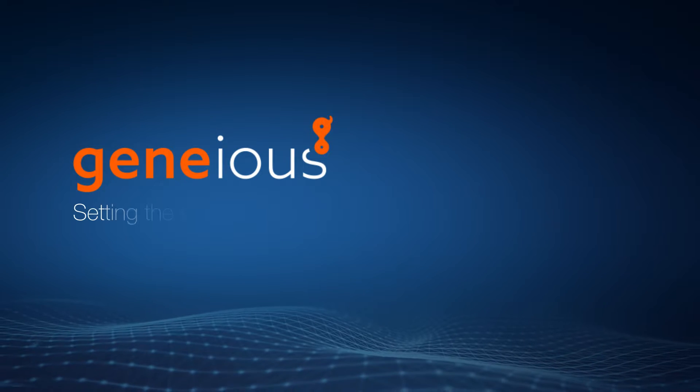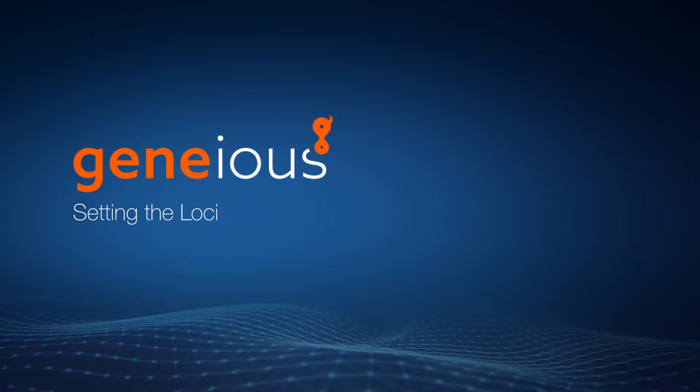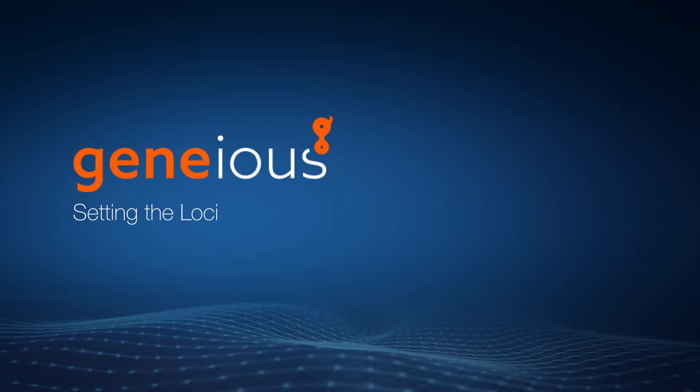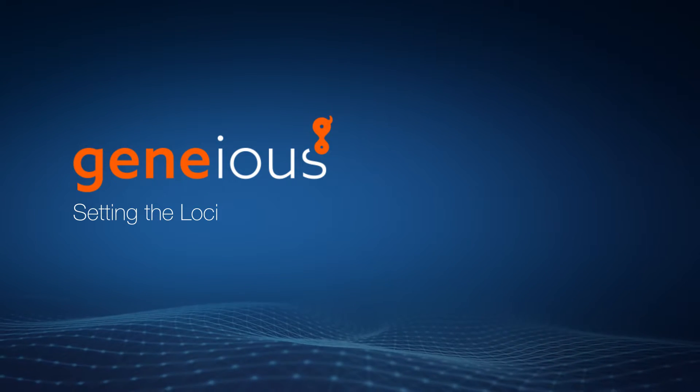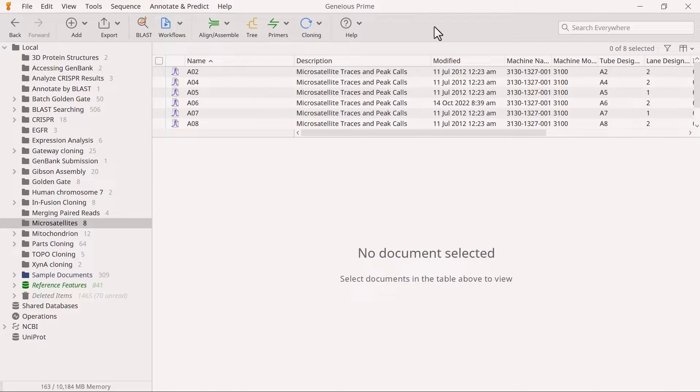Welcome to this video on setting the loci for microsatellite analysis with Genius Prime. After fitting the ladders, the next step in the microsatellite analysis workflow is to set the loci.